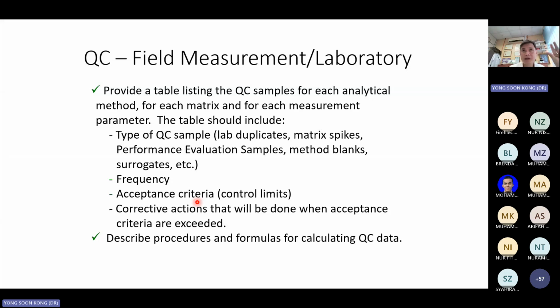Like for example, if you expected your samples to give you a certain value, does it fall under that value? Usually when we talk about QC kan, when we test it, the value will be extremely accurate. If not 100%, 99%. So apa yang awak analyze, kalau dia tak keluar balik apa yang kami nak, that means wujudnya error.